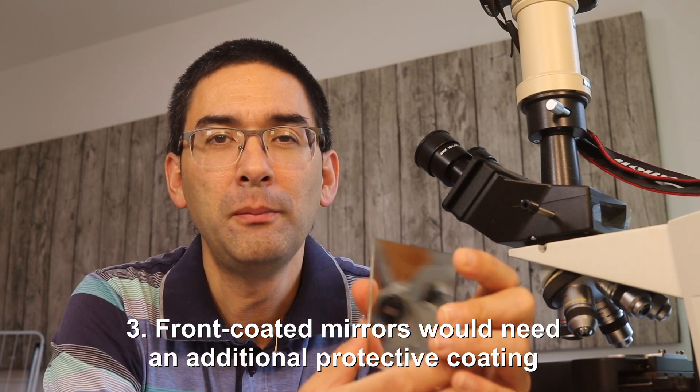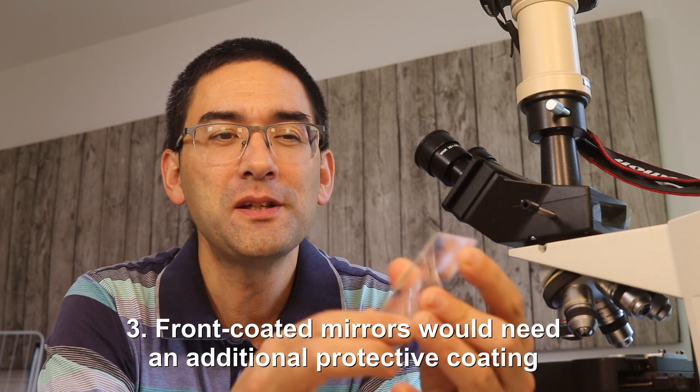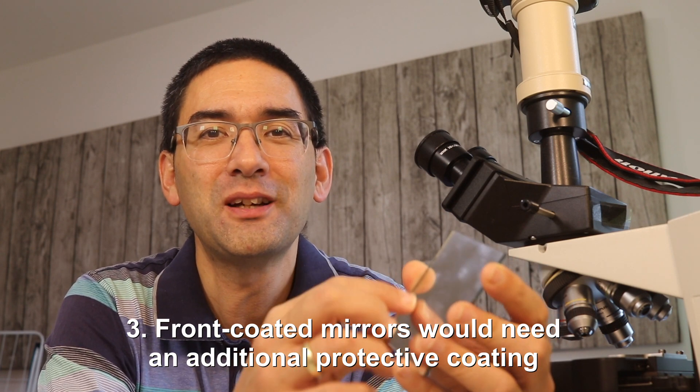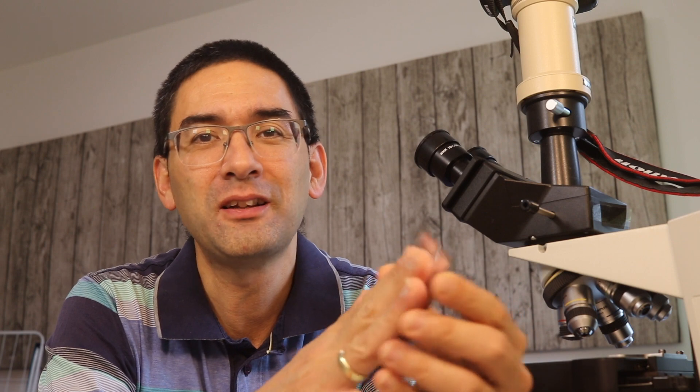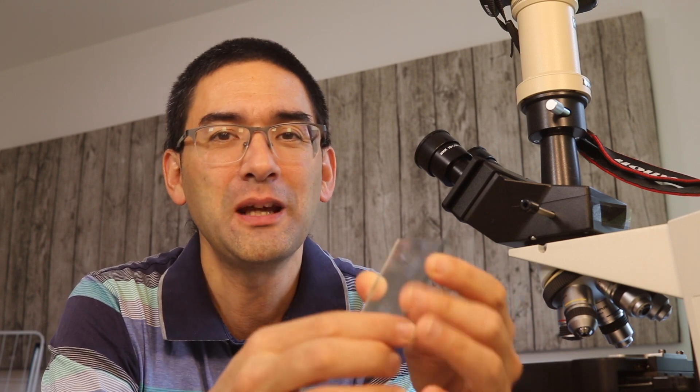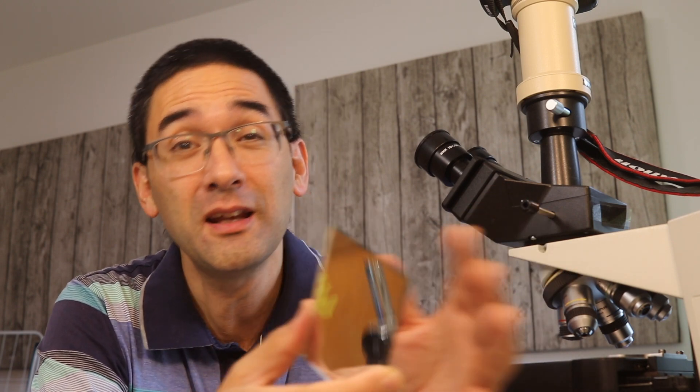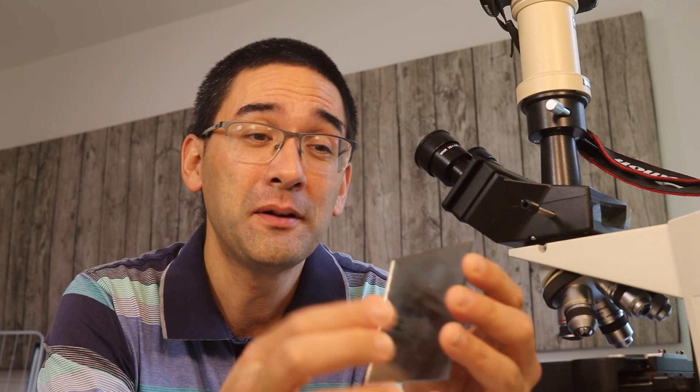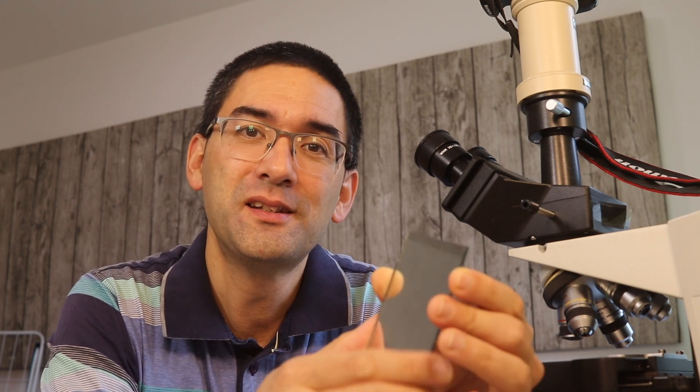However, there is a problem besides manufacturing costs and so on. One of the problems is that this aluminum has to be protected because it likes to react otherwise with certain chemicals in the air, possible oxygen may be making aluminum oxide, but that is again not so nice. So you have to add a protective coating on top of the mirror surface and this means that there are additional manufacturing steps involved and this can also complicate the matters and make everything a little bit more expensive.